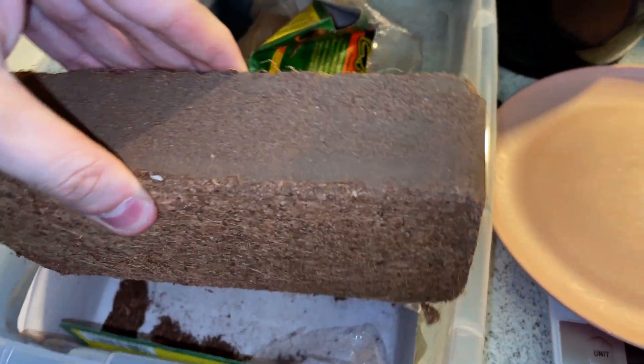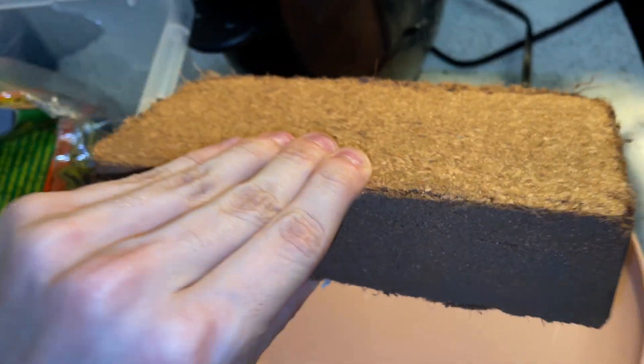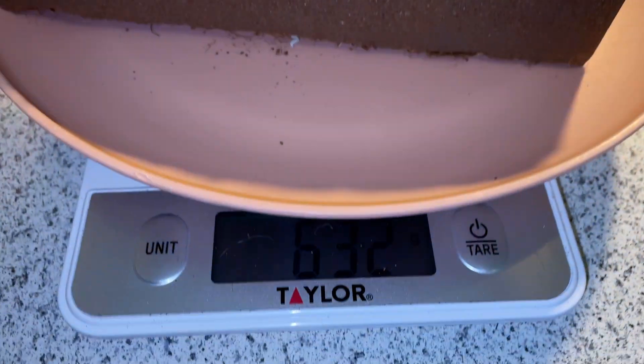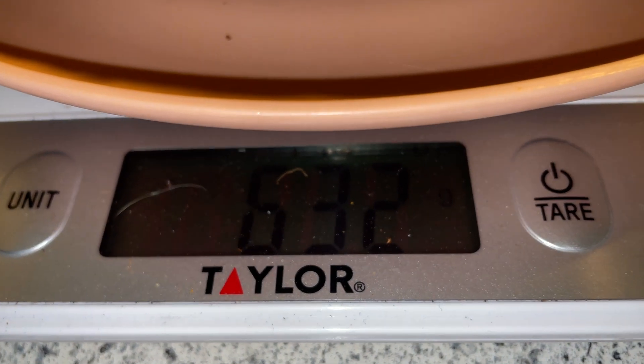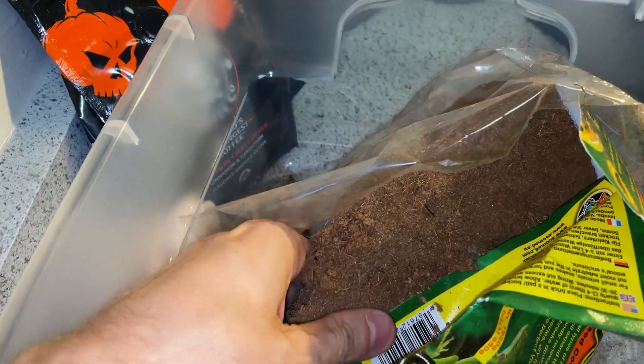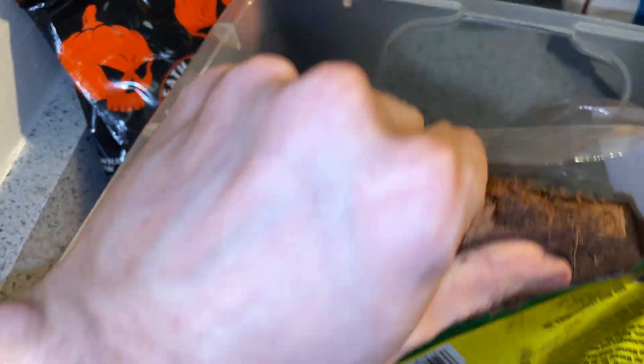Today I wanted to give you all an update on how all of our current channel projects are going, as this is the first attempt of me hunting for specific traits and trying to isolate them. This is 100% something that you can all do from home, so follow along and watch as we all evolve together as one mycelial network.